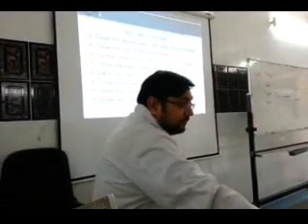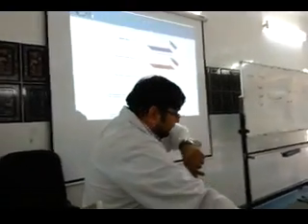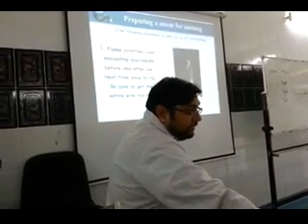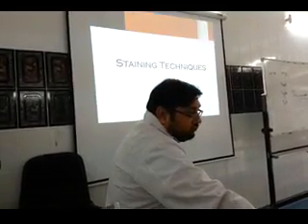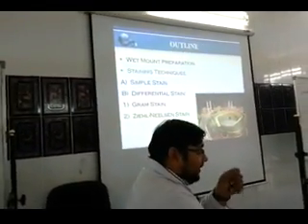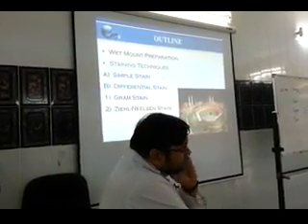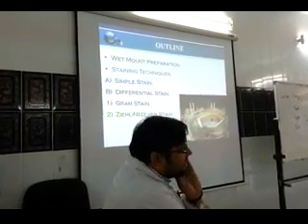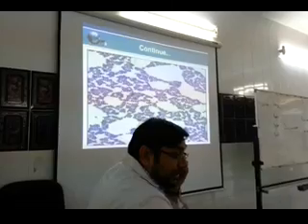I showed you here somewhere. Wait. It's in the start somewhere. You check the spelling for it, okay? Because you will have a problem there. Here. Ziehl-Neelsen stain or acid-fast stain, same thing. Okay? Yes. Mycobacteria, like TB, like leprosy.